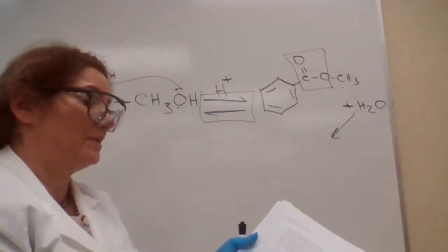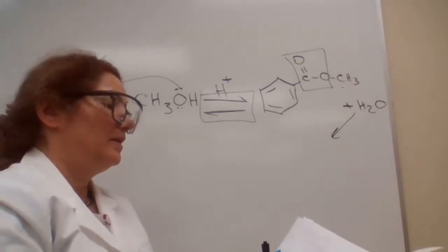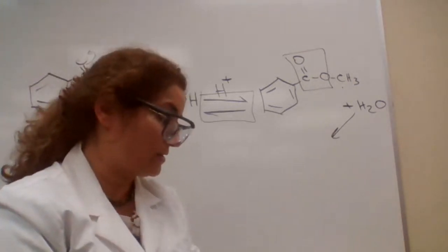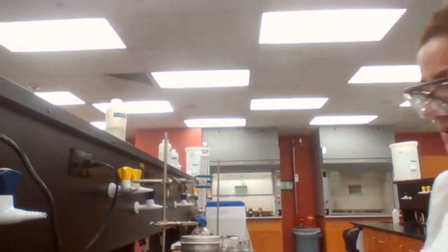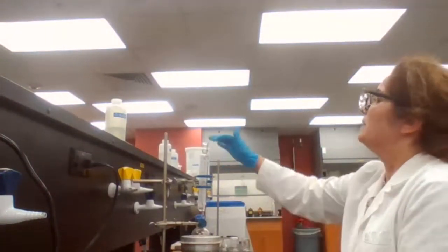Points for this reaction, the experiment based on the lab technique. Again, setting up the reflux. Why are we using reflux? Because the reaction takes time and requires high heat. So we have to use reflux to make sure the reaction is happening for a long time at the high temperature.